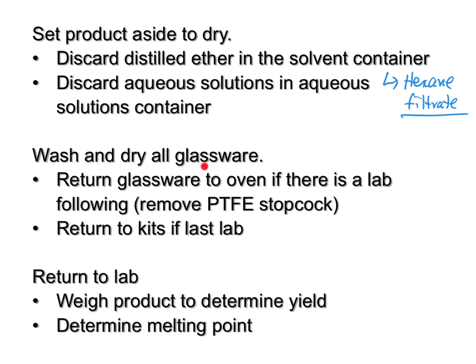You'll need to wash and dry your glassware. If there are labs to follow you, return the glassware to the oven. But remember, before you put it in the oven, remove those plastic Teflon stopcocks. Okay? If you're the last lab, dry the glassware and return the glassware to the kits. Do not leave it on the lab bench. Set your product aside, come back in a day or two, right? Weigh your product to determine your yield, and then determine the melting point of the product.